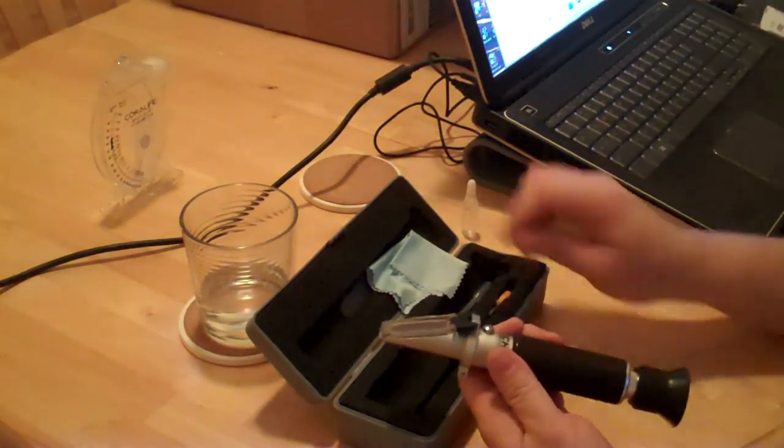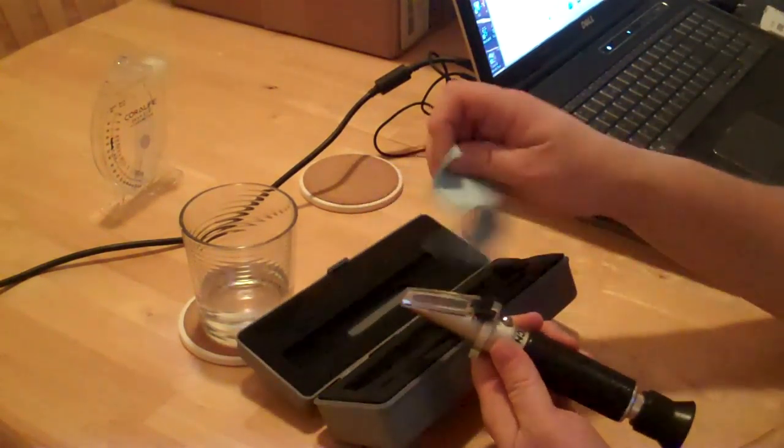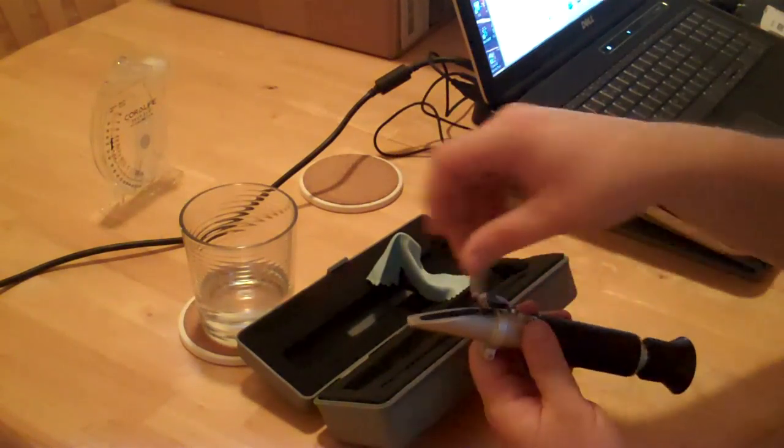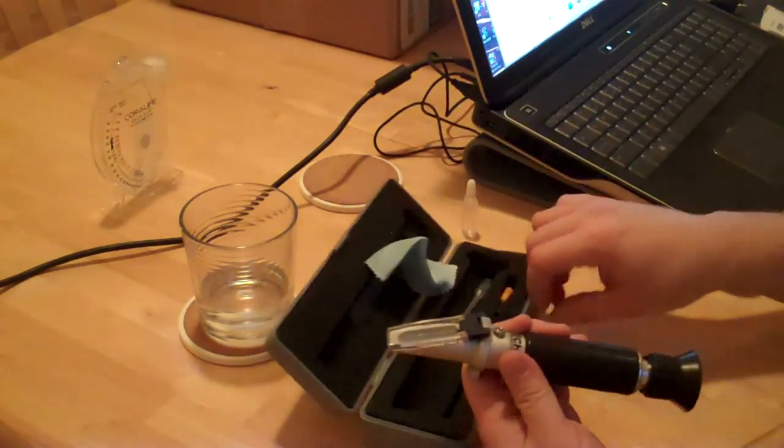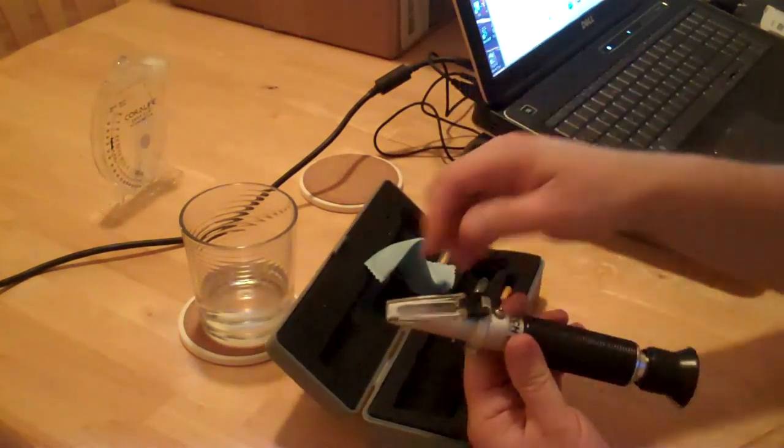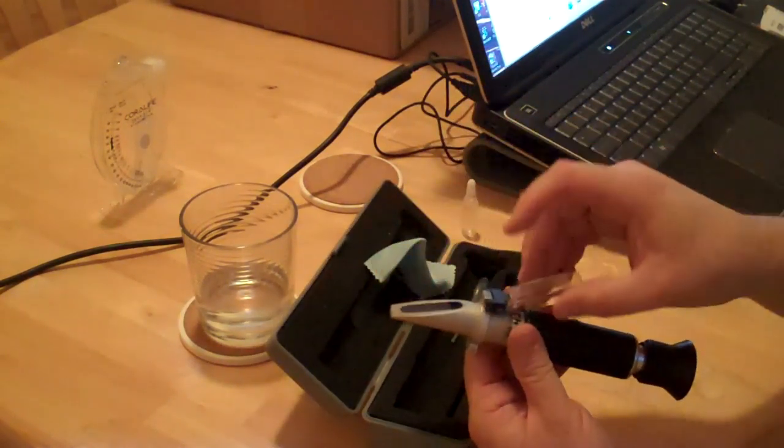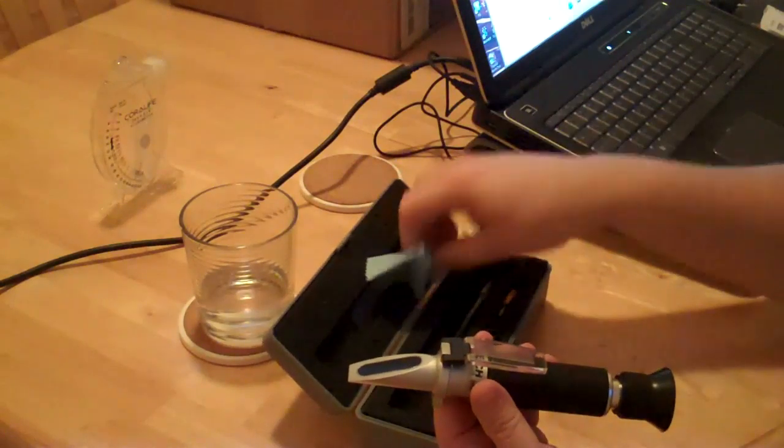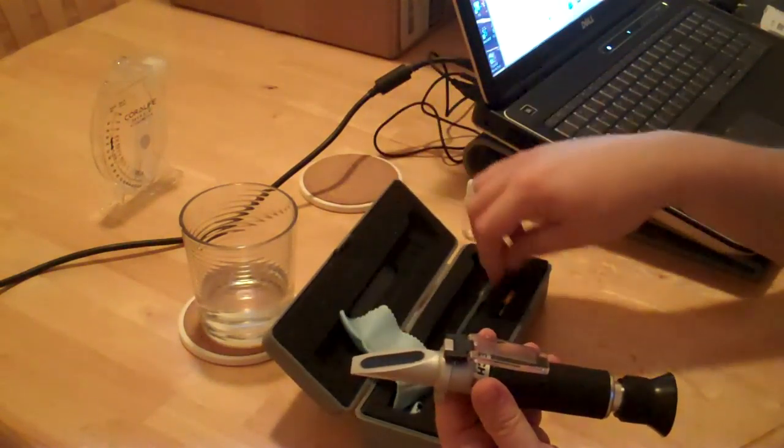Now you wipe it off. Real simple. Grab some salt water, do the same thing. Put a few drops of salt water on here from your bucket or tank.